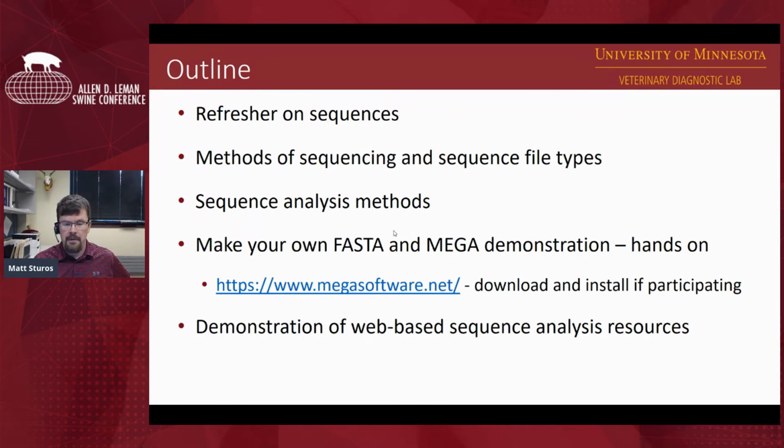And then I'll demonstrate how to do the analysis in MEGA, which is a free program. You do need to go yourself and download it. It's not something that I can distribute. And there should be a link to the MEGA software website. And then I'm going to demonstrate, depending on how much time I have left, some of the web-based sequence and analysis resources that you can access, both freely available and then University of Minnesota VDL tools.